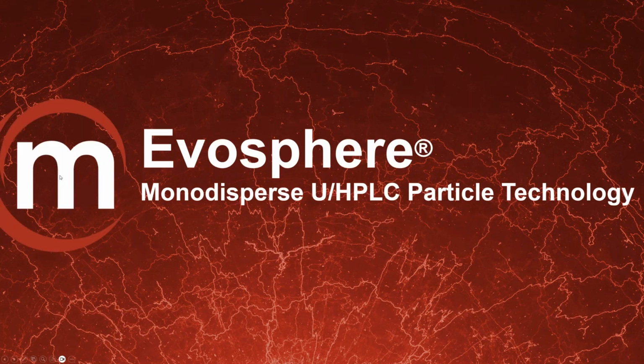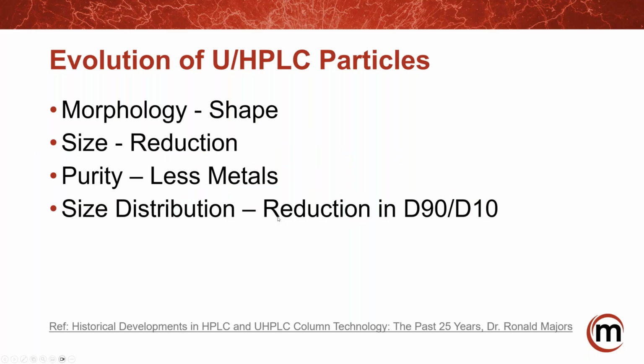The technology that we're using today is the Evosphere monodisperse particle technology. Just to review, there were some innovations in how particles have changed over time. You have the morphology of the particles, so the shape has changed.